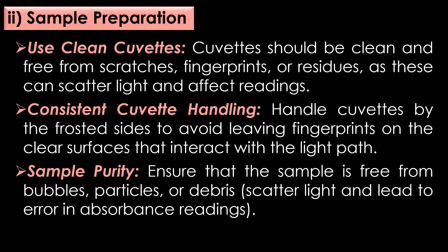Preventive measures in sample preparation. First, use clean cuvettes: cuvettes should be clean and free from scratches, fingerprints, or residues, as this can scatter light and affect readings. Second, consistent cuvette handling: always handle cuvettes by the frosted sides to avoid leaving fingerprints on the clear surface that interact with the light path. Third, sample purity: ensure that the sample is free from bubbles, particles, or debris, which can scatter light and lead to error in absorbance readings.